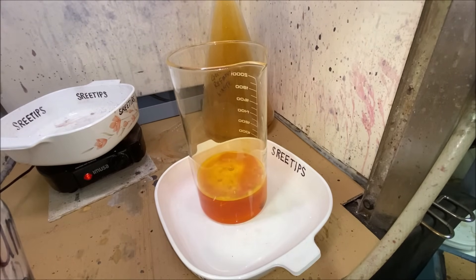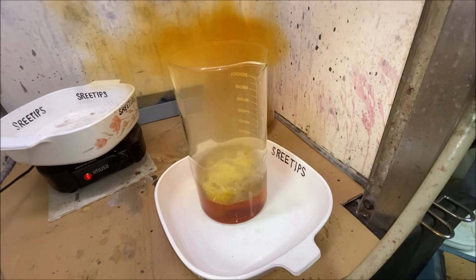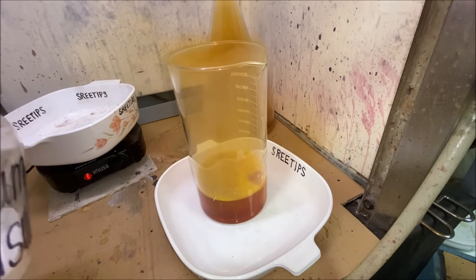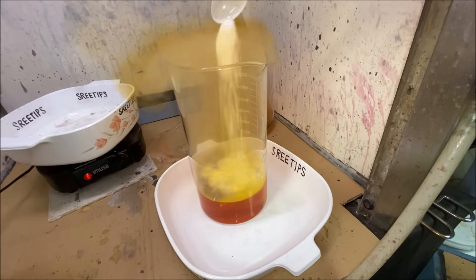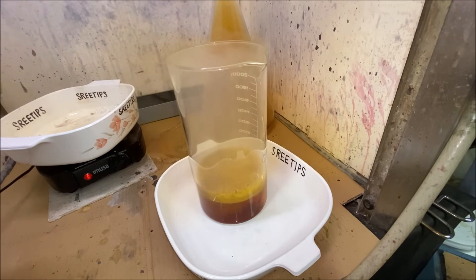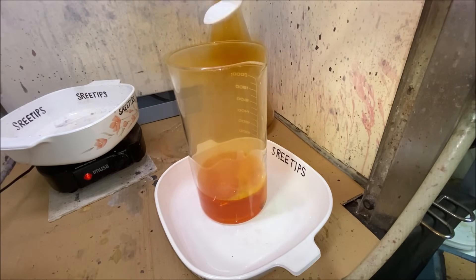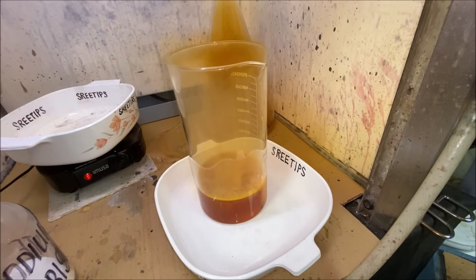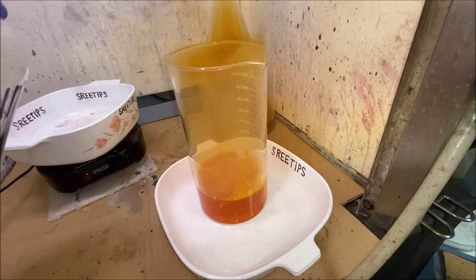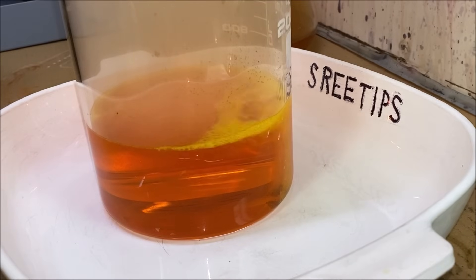Yeah, the gold's coming out of solution, but going right back in — it's acting like it's got a whole bunch of excess nitric in it. That confirms it's important to get all that excess nitric out before you boil it to get it to settle out. See, that gold is going right back into solution just as fast as it precipitates. Let me add some more SMB.